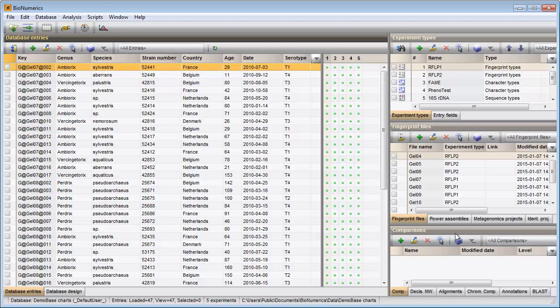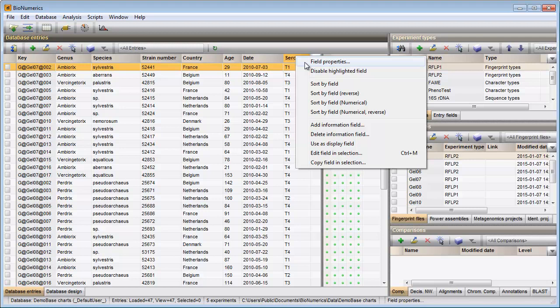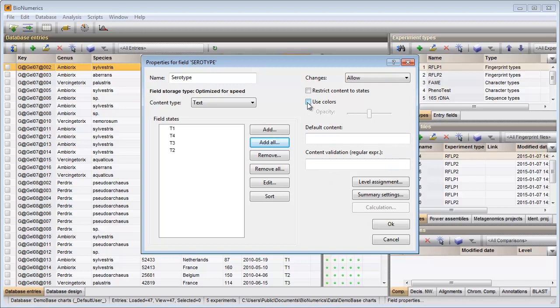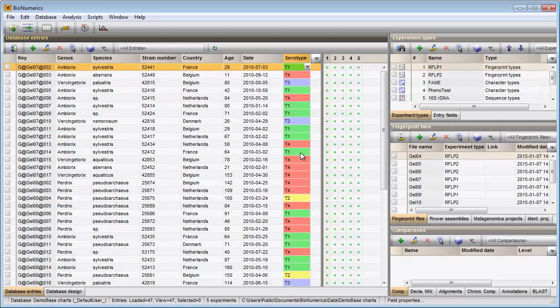First I will define field states for the serotype field in my database. I right-click on the field, select the first option and let BioNumerics create all possible field states in my database. I check 'Use colors' to give each serotype a different color. The serotype cells are now colored based on their content, and I will use this coloring in my bar graph.